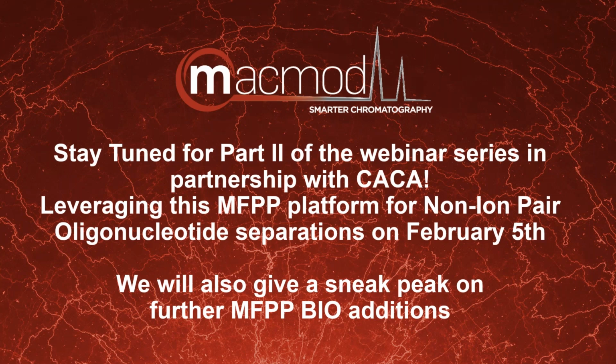With that surface area, as a secondary benefit, we're seeing more retention in general. For polar compounds, I showed the one where we're able to retain isoleucine and leucine. Those log Ps were around -2.